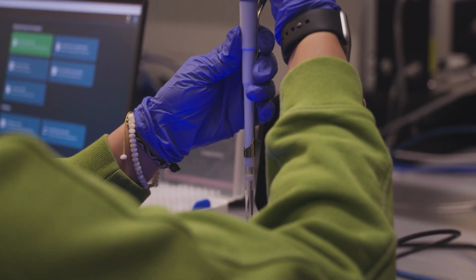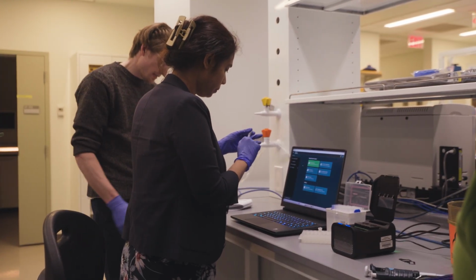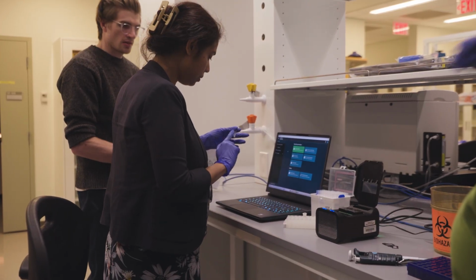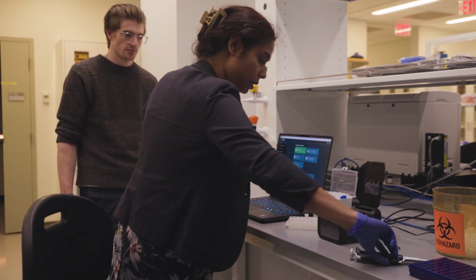That's fine. Do it with the same technique. You can just mix it again. So plasma, CSF, how do you want to do it? CSF on the left, plasma on the right. Do you want to do it, or I can do one and then you do one.